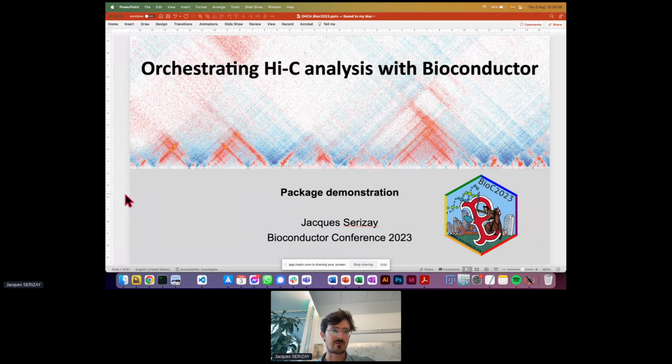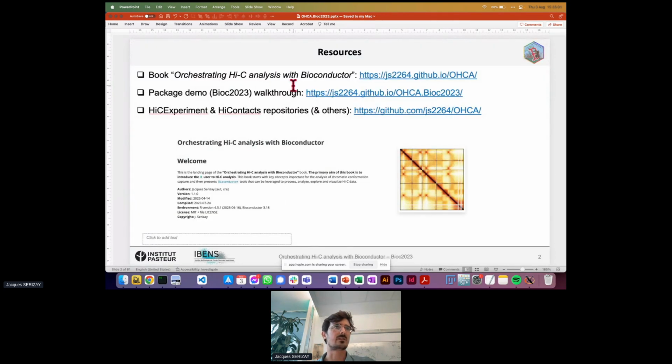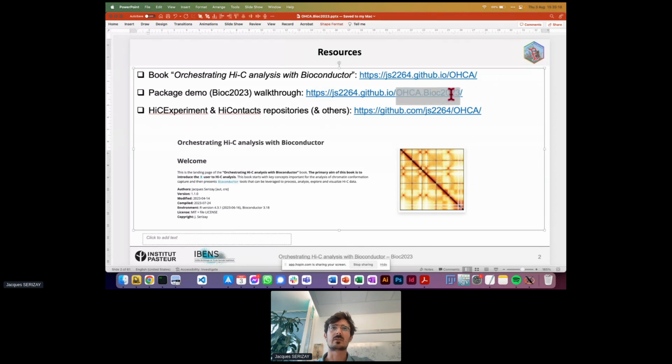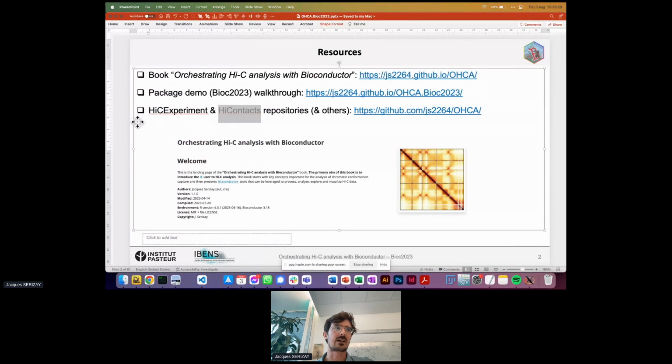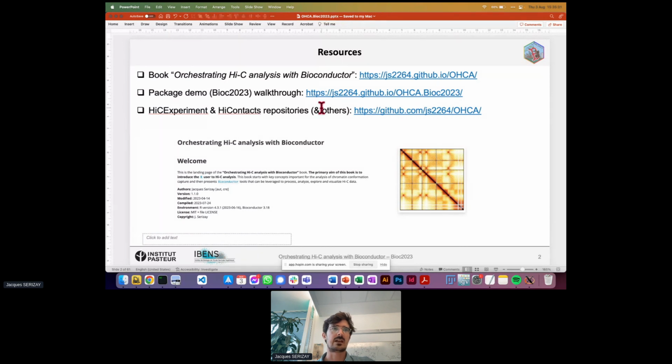Before I get started, I wanted to point out some resources. There's a full-featured book that I have written, and it's available at this website. There's also a package demo website, on the same repository, bioc 2023, and today we're going to talk about the HiCExperiment and the HiContacts packages, and you can find their repositories at the same link here.